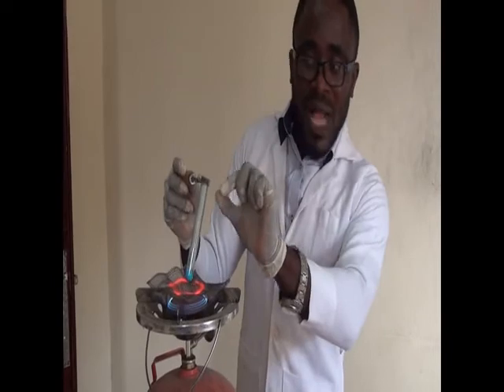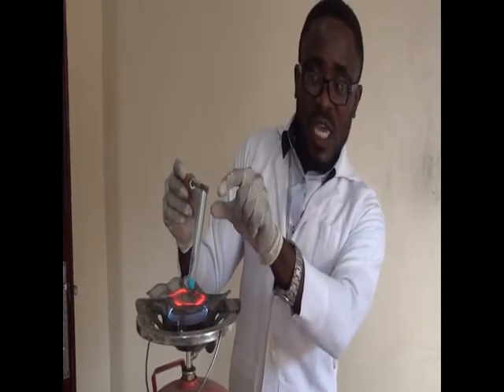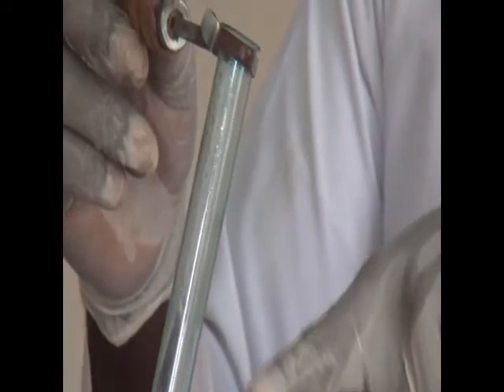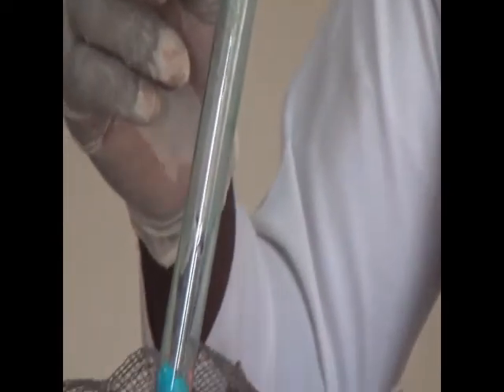If you look at the top of that test tube, you see some condensation. It condensed at the top. It means something is going on. A chemical reaction is taking place. And if you look at the bottom of that test tube, you find a color change. There is a change in color immediately.